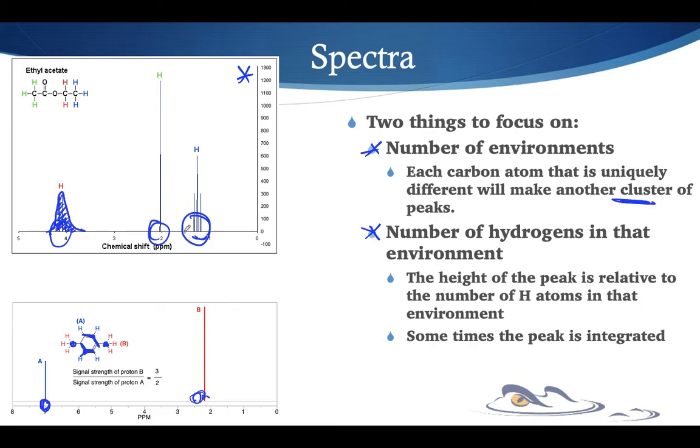And for this one, it would do the same thing. This is a curve that goes up and comes down, and then it's going to measure the area under the curve, right? Same thing for this one. Now, this curve is not very wide, but it's very tall, isn't it? This curve is fairly wide, but it's not as tall. If you'll notice up here in the color-coded picture, here is the blue environment, and it has 3 hydrogens on it, yes?